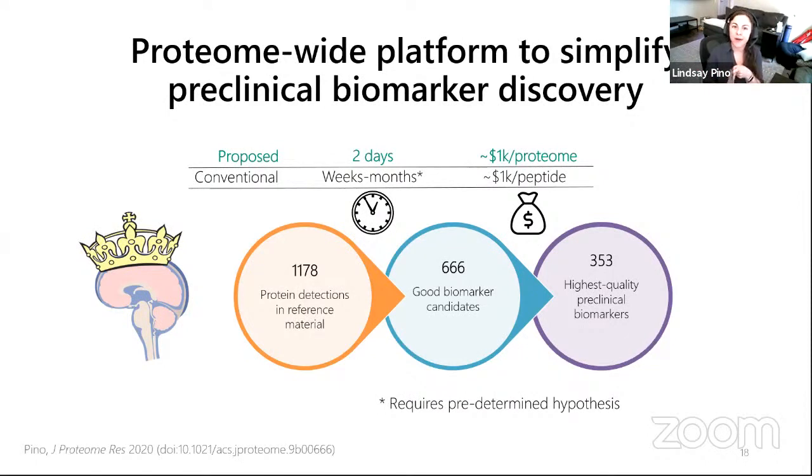The other paper, senior author, last author is Steve Carr, and it's the Fit for Purpose paper. So these two papers are, I would say, the gold standards for doing preclinical biomarker discovery in proteomics. There are further clinical validations. CLSI has a workbook, but that's super thick, with all the FDA regulations to get to an actual clinical biomarker. So it's a great question. I think we got that one.